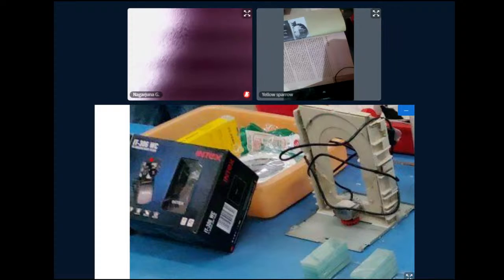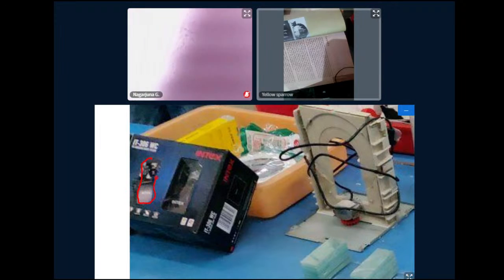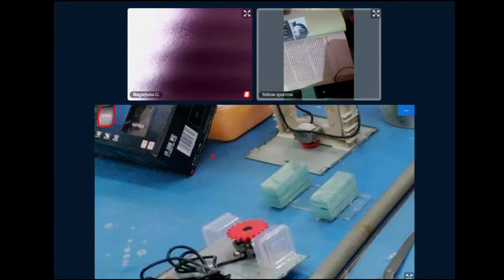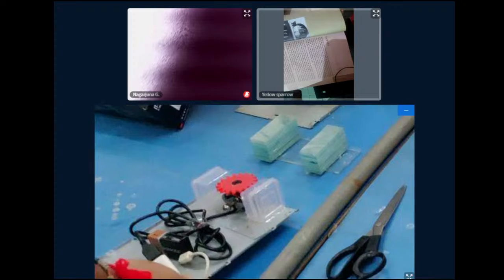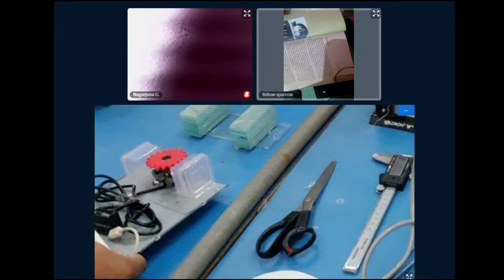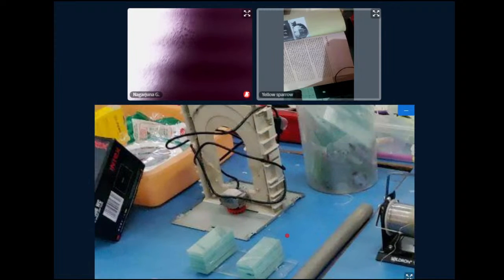We used a scrapped DVD writer and are trying to make a stage out of it. At the bottom there is another approach to making this webcam-based microscope, where we put the webcam in the middle and made a stage out of two empty small boxes. We got a metal sheet from the writer, and then created a small gear.